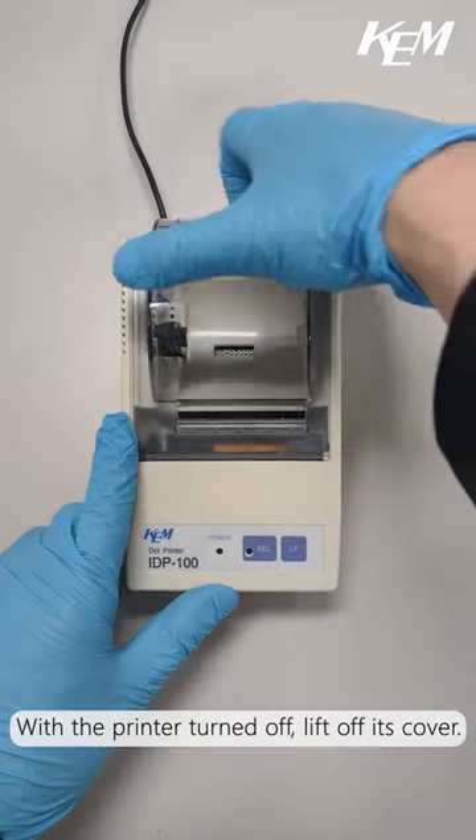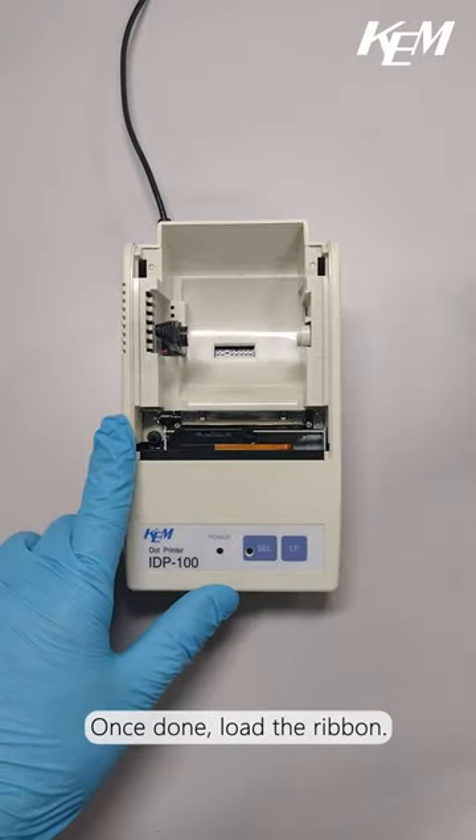With the printer turned off, lift off its cover. Once done, load the ribbon.